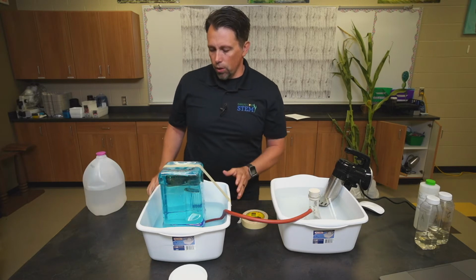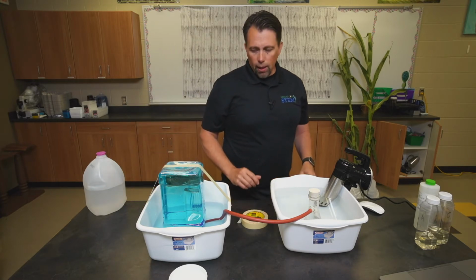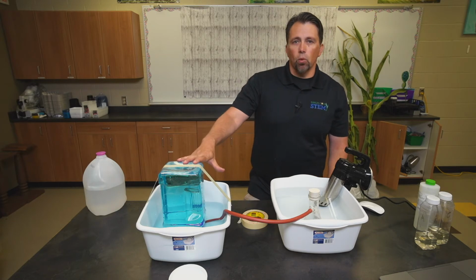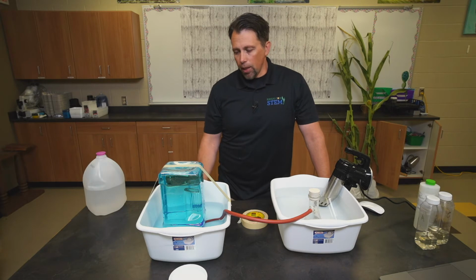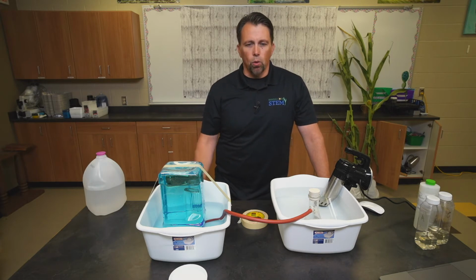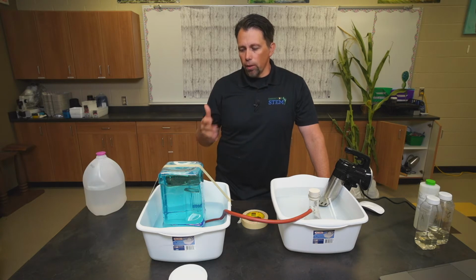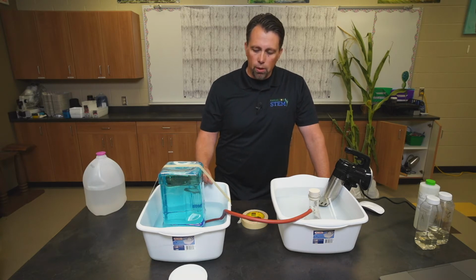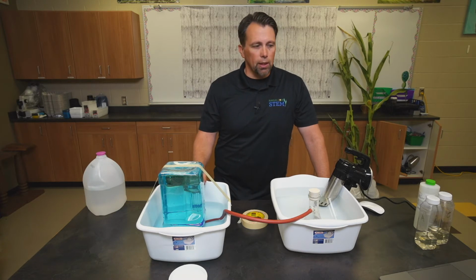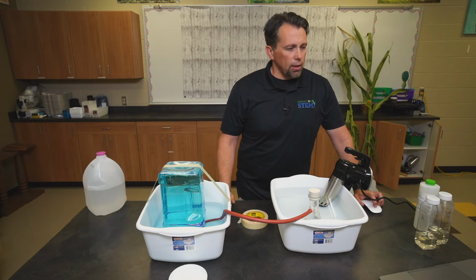So we'll tape that down so it doesn't float away as it fills up with carbon dioxide. The carbon dioxide absorbs back into the water relatively fast. You'll be able to watch it on time lapse. I usually use an old iPad, or if you have an old iPhone 4 or something that you can plug in and run. You can run a time lapse on it and watch and record the most carbon dioxide that ends up in the container.